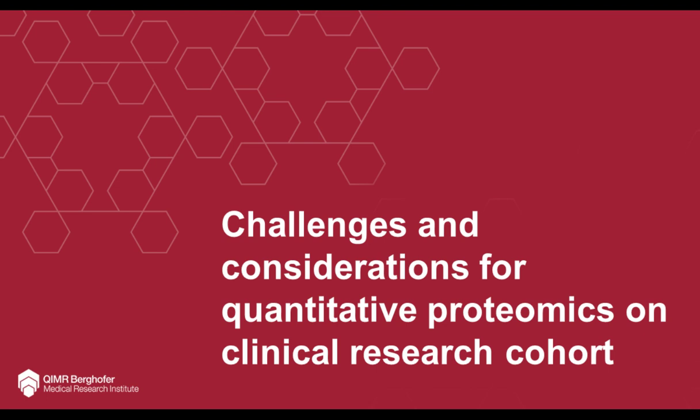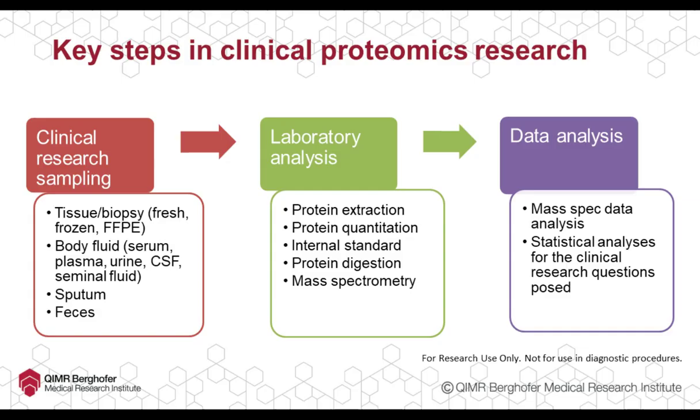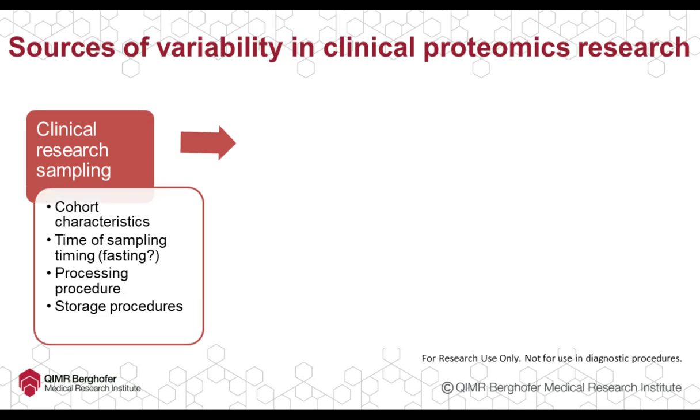Now let's get back to thinking about the clinical cohort research design for using quantitative proteomics techniques. Now go back to this slide, which I already shared with you, on the different steps that we have to think about during a clinical proteomics research study design. So let's go through them in steps.